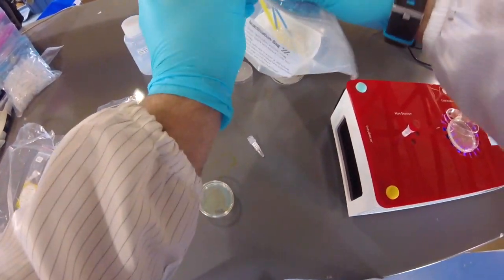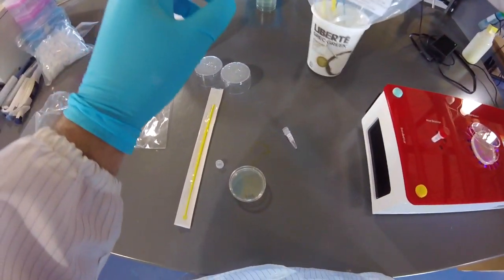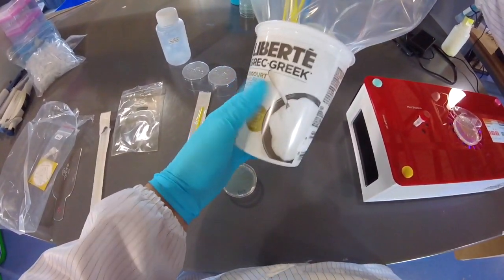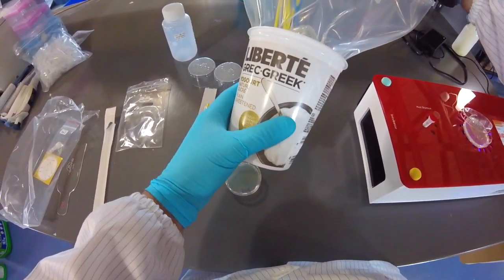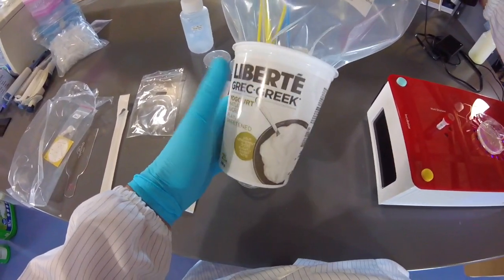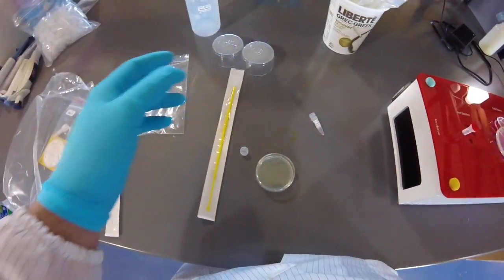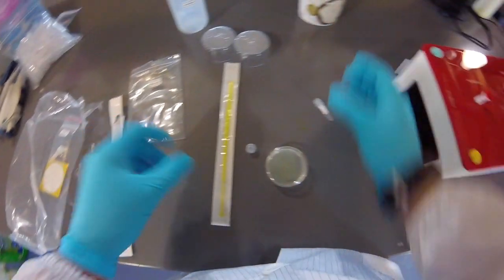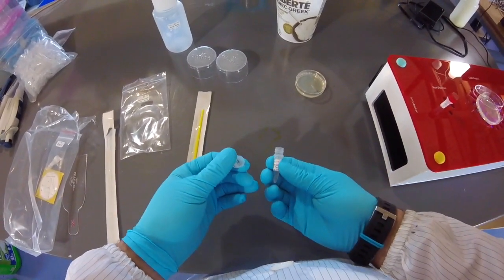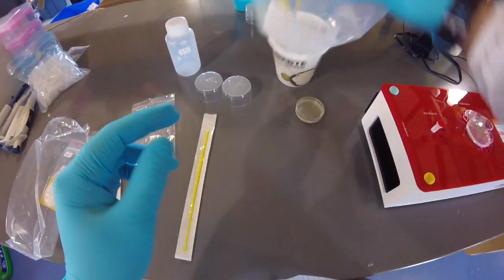All right, now I'm going to put my loop into the inactivation bag. If you're in a classroom, you might just have a yogurt container and you can just put all your stuff in the container or your discard container, and then at the end of the class you can pour your waste into the inactivation bags that were in your kits. Okay, so this one's done. That means my positive control cells are also done. I'm going to put those inside of the inactivation bag.